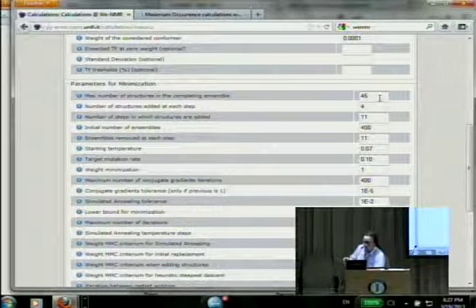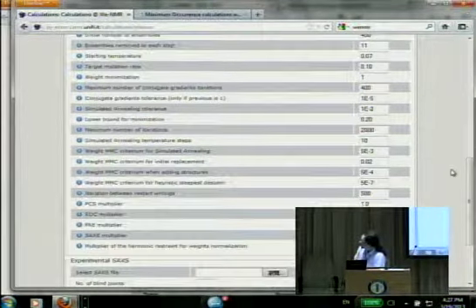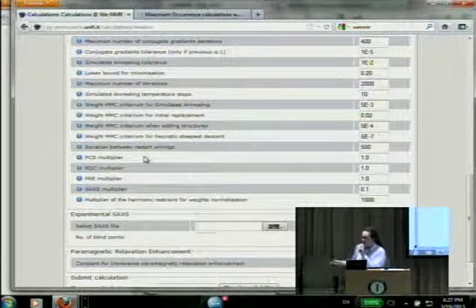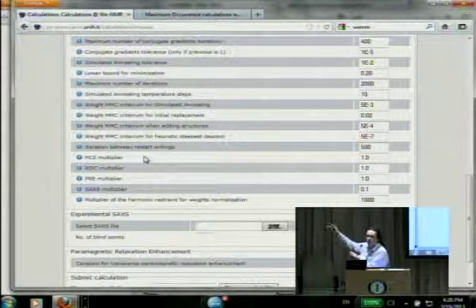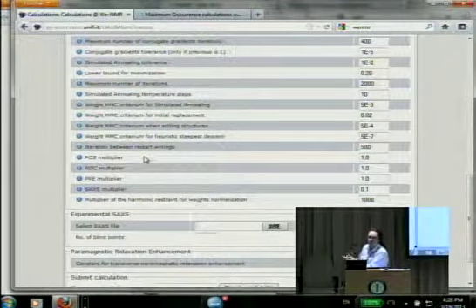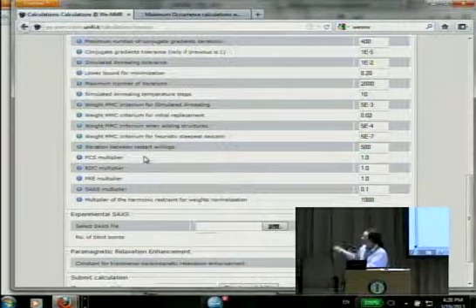Of course, you don't know a priori the range of the target function, because that also depends on the experimental errors you have. So the idea is that you run this calculation several times, each time looking at the first round of results and adjusting these multipliers in order to bring the target function into the range. Is that arbitrary? It's pretty arbitrary, I have to say.